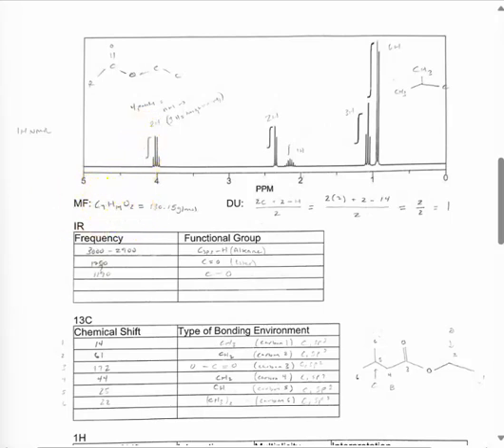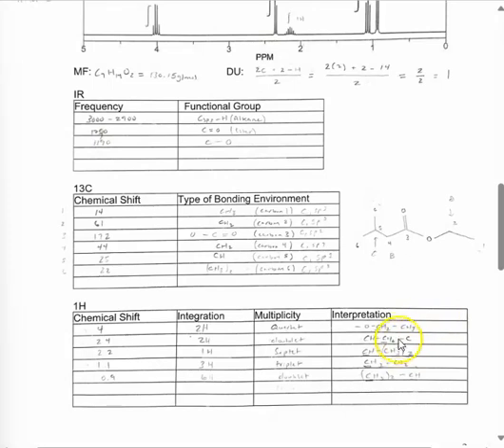Because of the data provided, we know that we have the presence of the ester already. So we know that this oxygen will connect to another carbon, which will connect to another carbon. Here we have our proposed structure, if we scroll down, as well as our interpretation. We have a CH2 group here, which is carbon 2 in our rough sketch, and we have a CH3, and so this oxygen is connected to this carbon, which is connected to another carbon, along with the presence of an ester group.